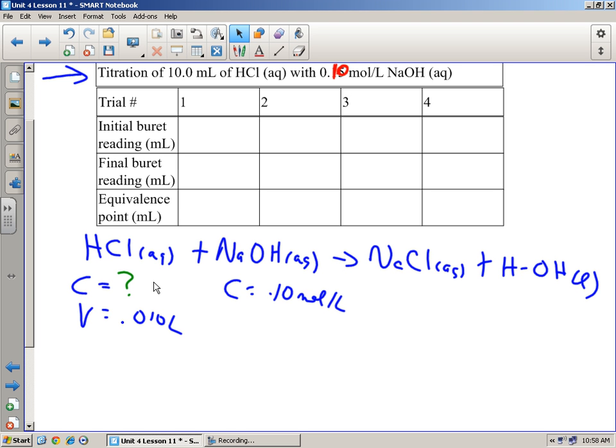Phenolphthalein in acid is clear. Okay? Phenolphthalein in a base is a pretty pink. Okay? I picked this one just for the girls tomorrow. Okay? So it's a pretty pink. Well, look, if our job is to get this perfectly, if I mix the right amount of this with the right amount of this exactly, if I mix clear with pink, I get this and this.